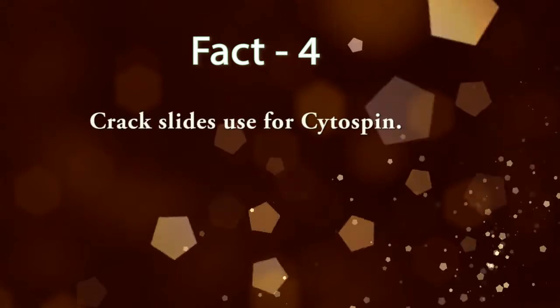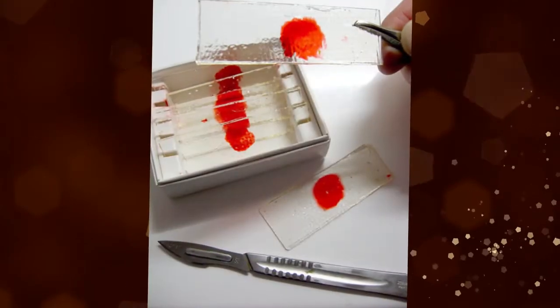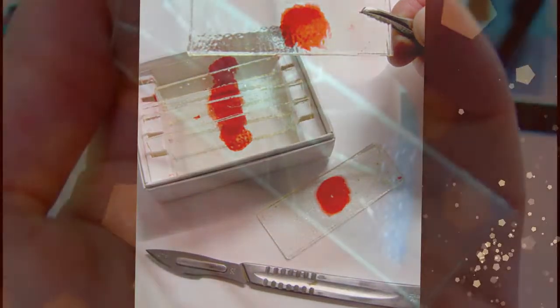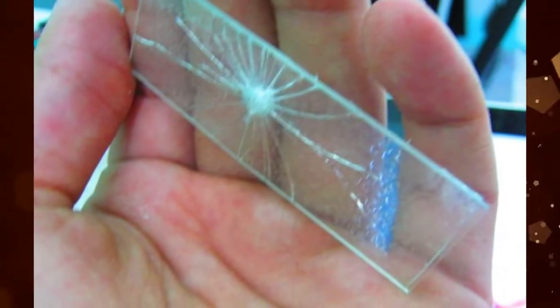Fact number four: Cracked slides used for cytospin. If slides present even very small crack, they can be completely destroyed after cytospin process.